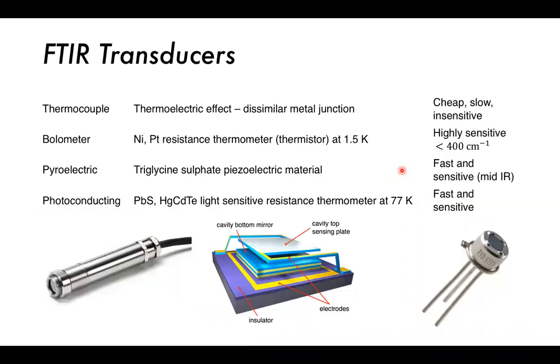So after we have produced our light and it has been absorbed by our sample at particular wavelengths, we'll want to know which wavelengths have actually been absorbed. And to do that, we'll need to use a transducer, which will produce the electrical signal, which will be what we are actually measuring. As much as we may want to measure the absorbance directly, it's not really possible. And so what we must do is we must measure the difference in the absorption versus the incident beam versus the exiting beam after it has passed through the sample.